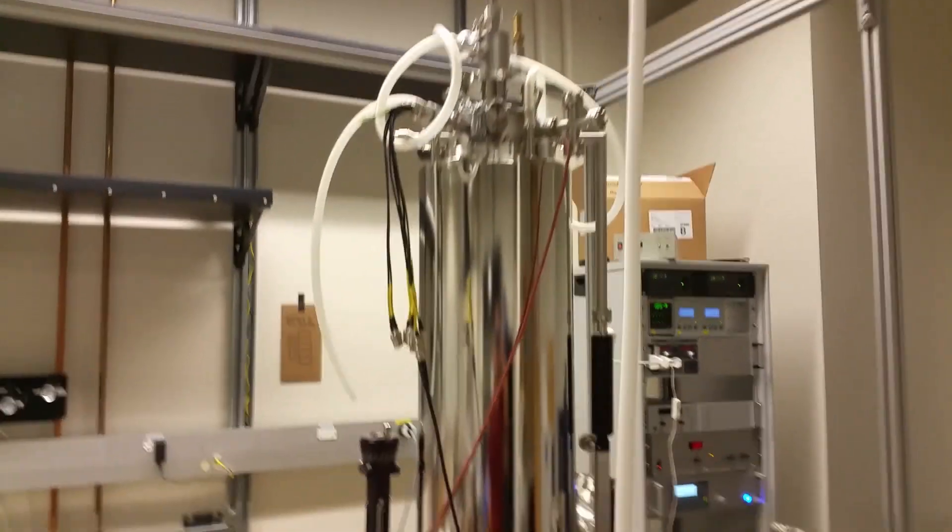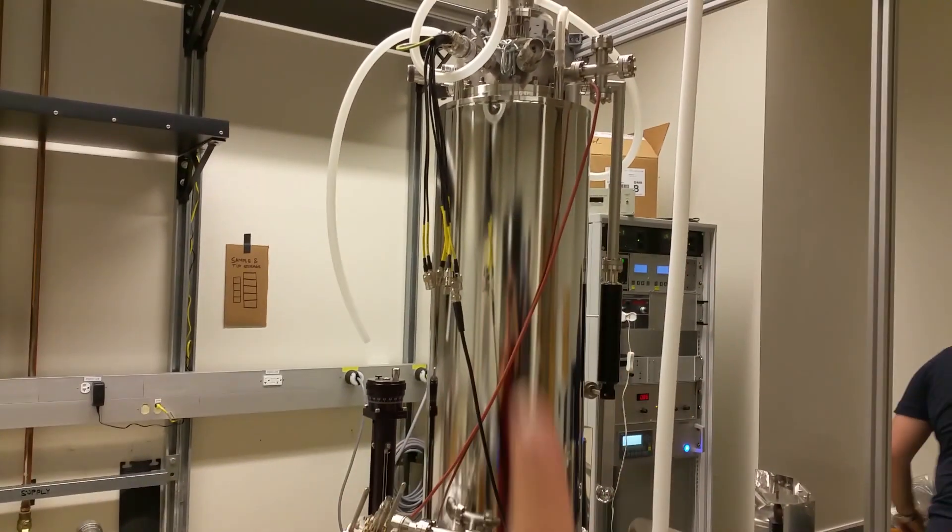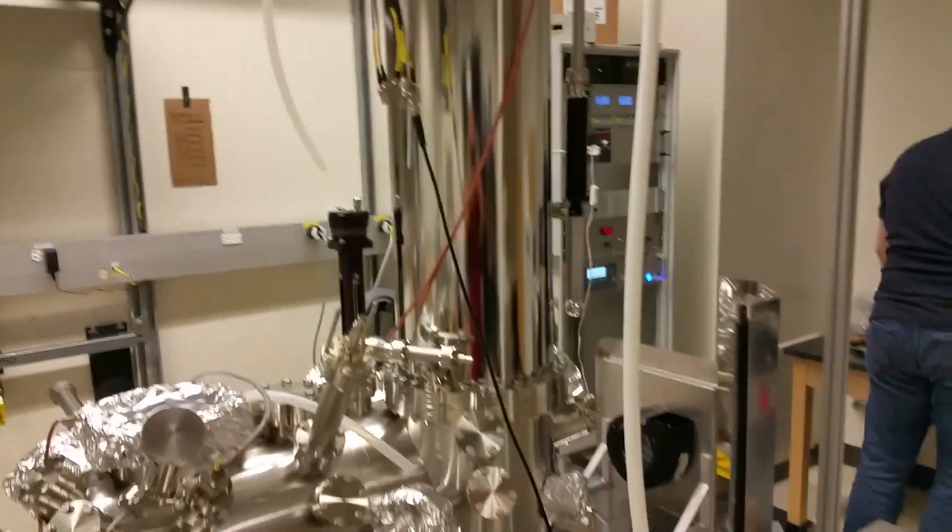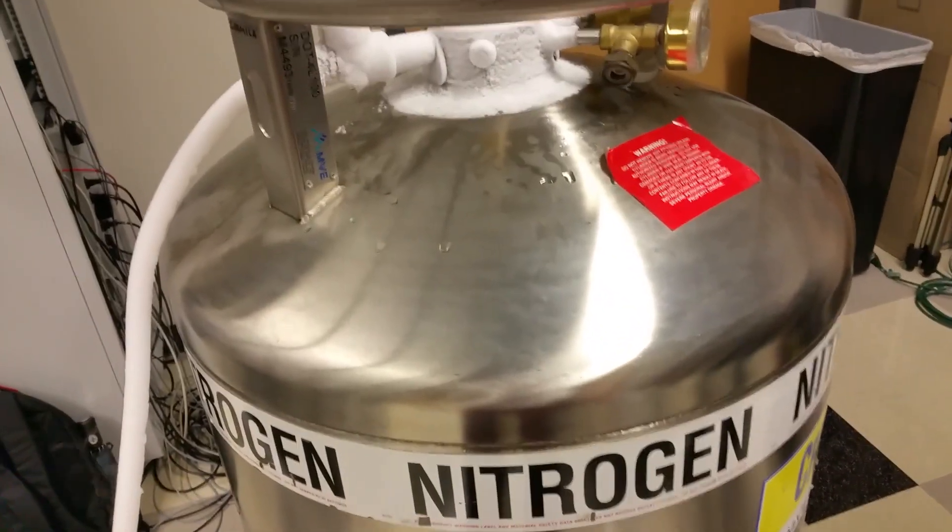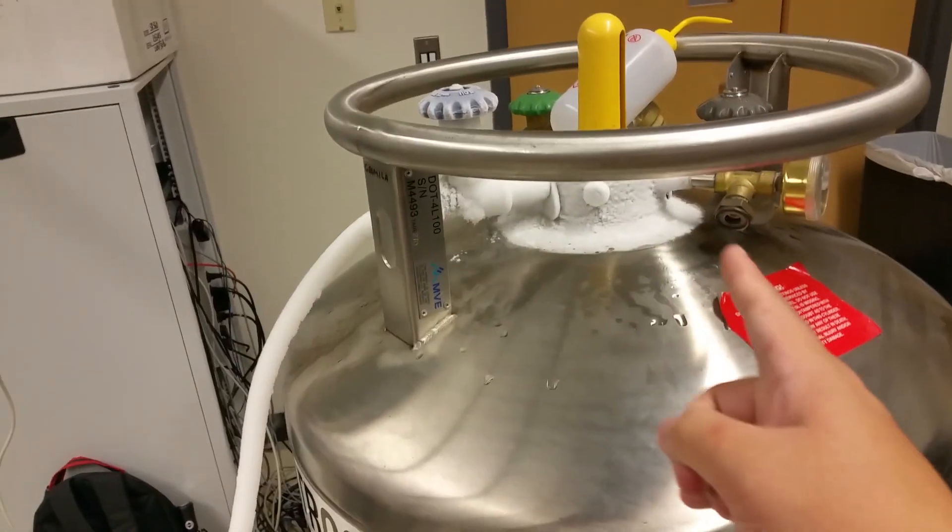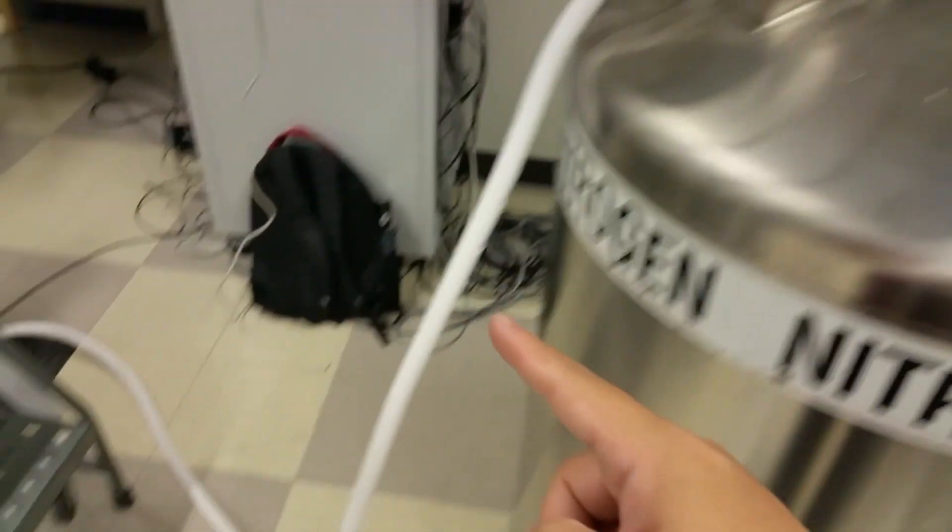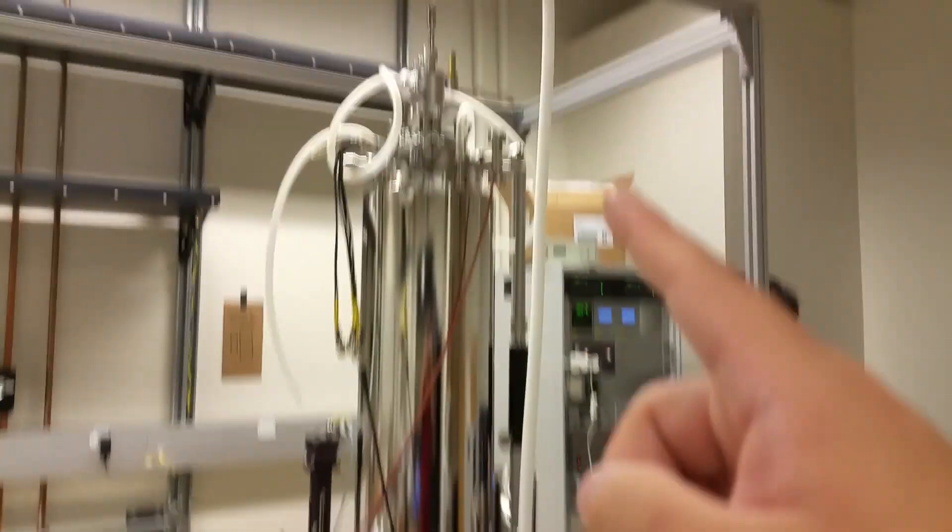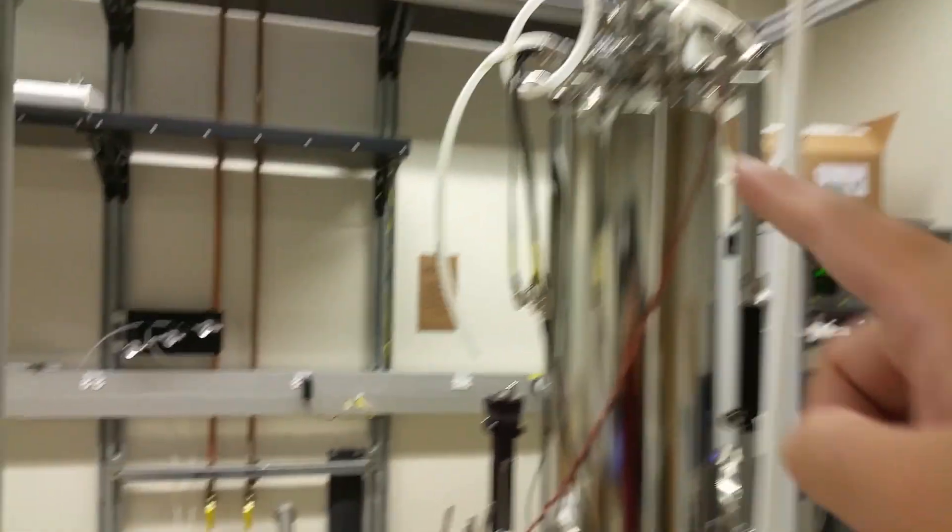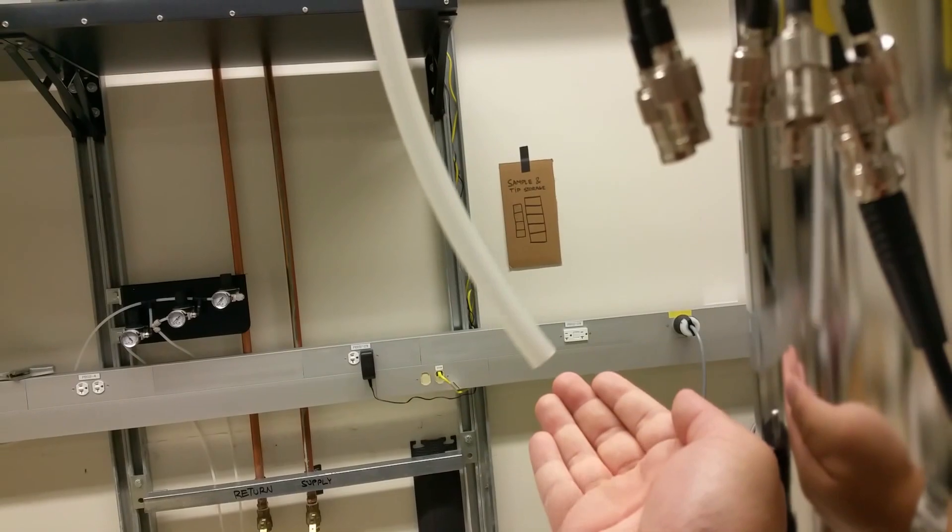We just took down the tent for the bake-out, so now we're cooling the chamber with cold nitrogen gas. Here is a tank of liquid nitrogen and there's cold gas coming out of here. You can see the lines frozen, and it goes up into the warm chamber and the gas comes out here warm.